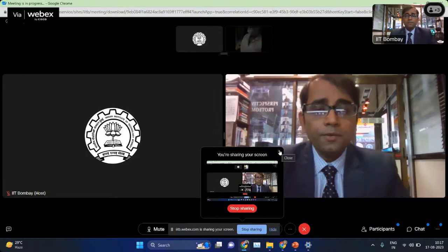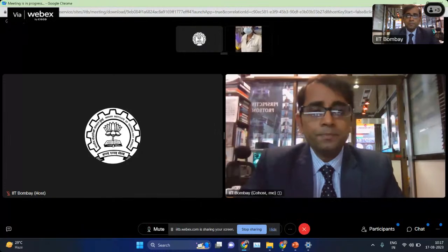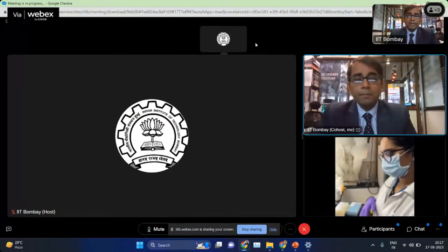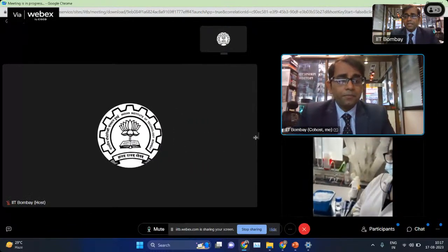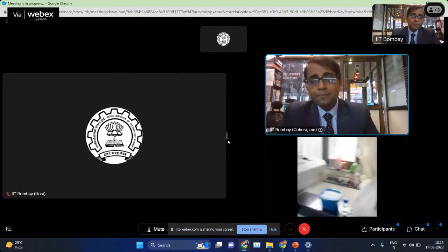Yeah, so the very first thing is what we will try. We will try to show you briefly the gel-based proteomics setup. Although, for the rest of the time we will mainly focus on your sample preparation strategies. But to begin with, we just want to show you how a 2D gel setup looks like in the lab.